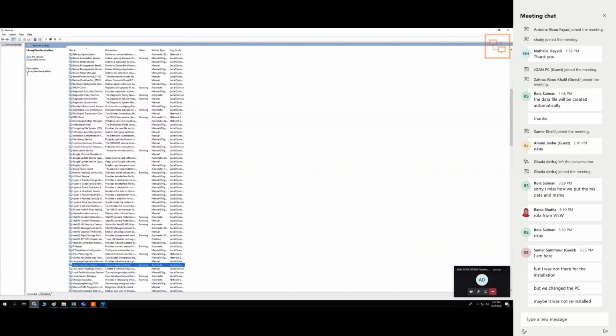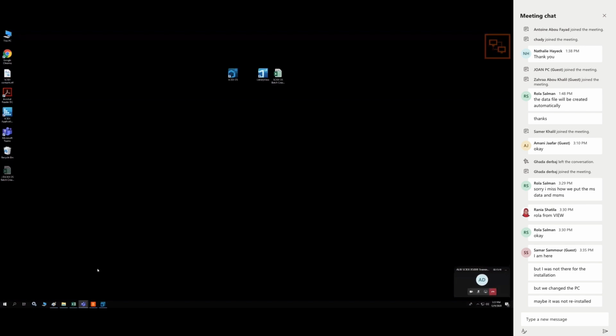And we can just say here, restart. Okay, so just do that little trick. And then let's look in Library View again.